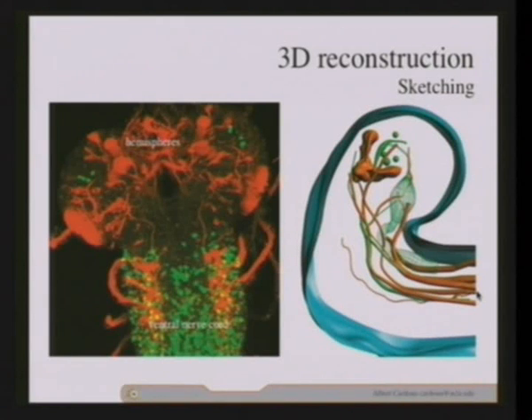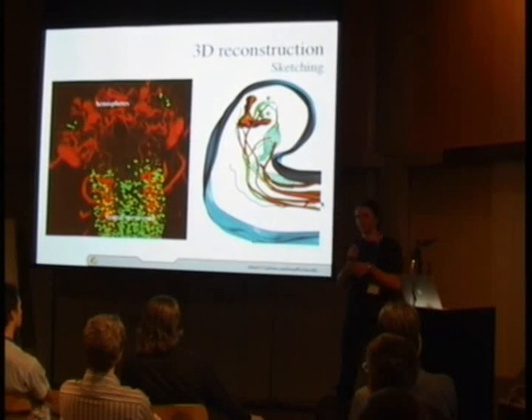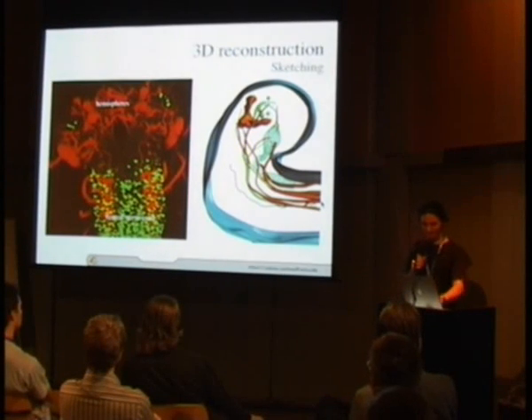So I can identify the gene expression in all these different projections of neurons and see whether they overlap or not. I can test for identity of these tubes with known publications, known descriptions of these projection patterns. And then of course I can extract beautiful renders that everybody envies in my presentations in the scientific community.